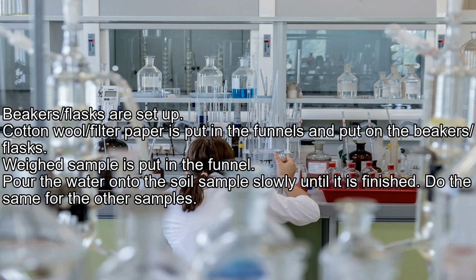Beakers/flasks are set up. Cotton wool/filter paper is put in the funnels and put on the beakers/flasks. The weighed sample is put in the funnel. Pour the water onto the soil sample slowly until it is finished. Do the same for the other samples.